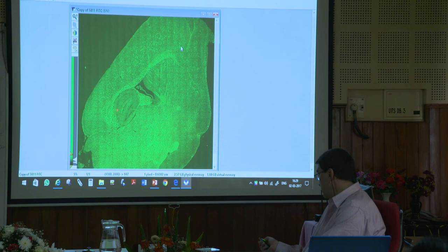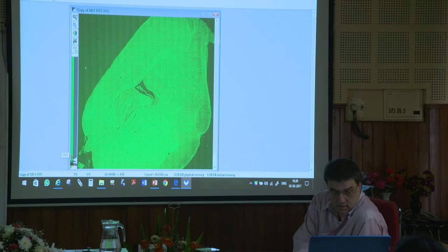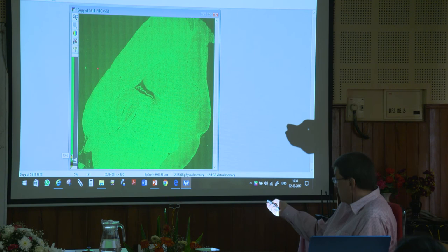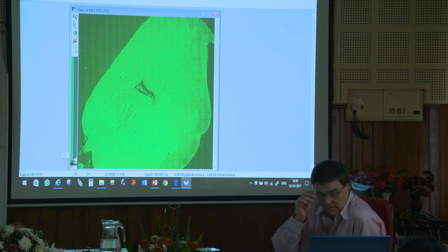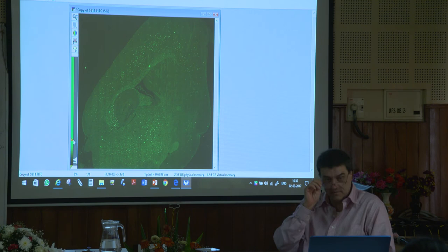You can see here, you can sort of see the stitching pattern if I make the contrast really severe. So you could tell, like I took a picture. So this is stitched together, probably hundreds of images. I forget the magnification, maybe 20x to look at a mouse brain. Now, her thing is she studies Alzheimer's. So does anybody here know much about Alzheimer's? What's Alzheimer's disease?